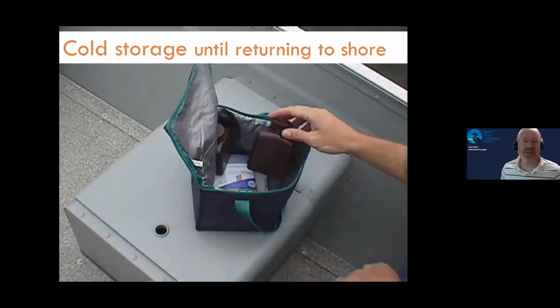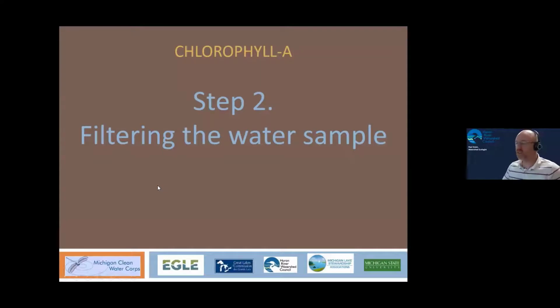So that's basically step 1 of the process. You have now collected your water samples, and now you're going to have to do the more complicated step, filter them. Now this is complicated enough that you really could need to see it in action. So I'm going to attempt to do a video.